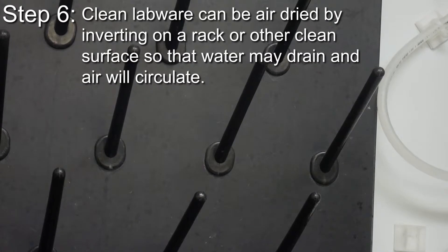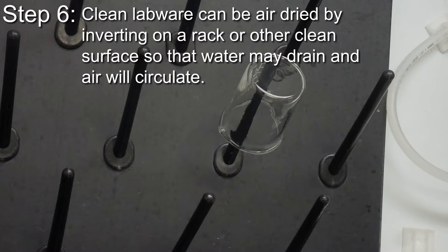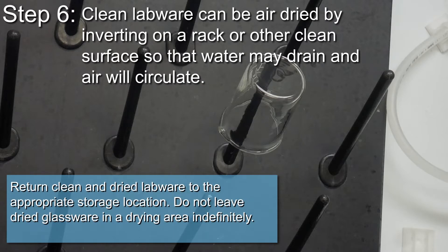Clean labware can be air dried by inverting on a rack or other clean surface so that the water may drain and air will circulate. Return clean and dried labware to the appropriate storage location.